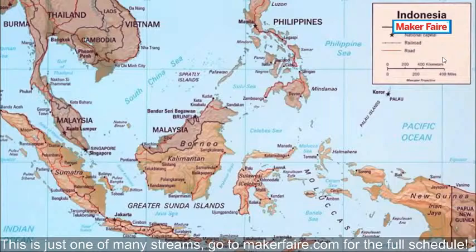Look at Indonesia. Almost 300 million people live on more than 10,000 islands. Total confirmed cases of COVID-19 exceeded 20,000, and the situation is getting worse there. Imagine if every small hospital on such islands had its own qPCR machine. Imagine how many lives could be saved. What's needed is not a single $200,000 machine in the capital city, but $50 machines on 4,000 islands.